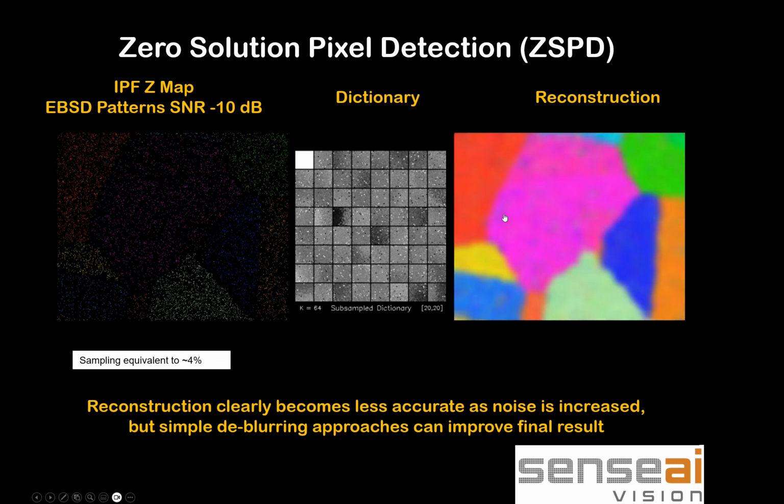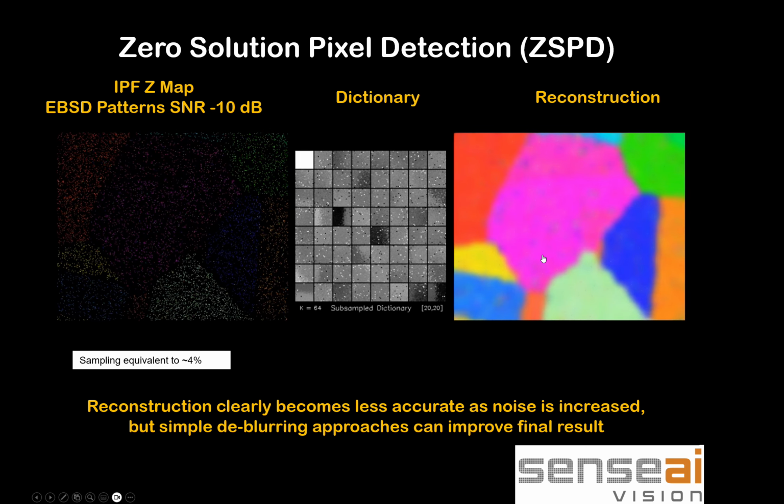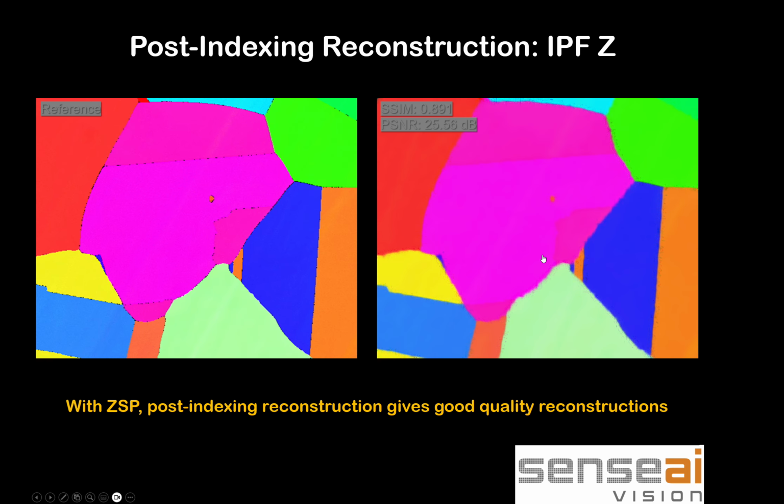Because we're going for a very quick reconstruction, we're getting something where we're filling in the low spatial frequencies. We haven't done the filling in for this one specifically, but I'll show one in a minute where we've done the deblurring, and you can effectively get through and reconstruct the image. So here it is after the deblurring, going through that process. You can effectively get a very, very high quality reconstruction with only a very small amount of data that you're actually acquiring. Again, not changing the physics, not changing the detector, just basically using the missing data and filling it in.